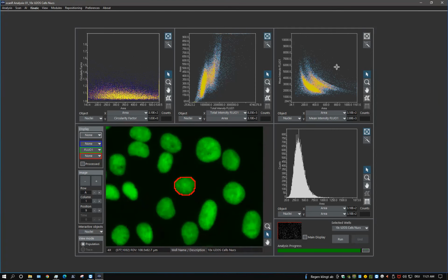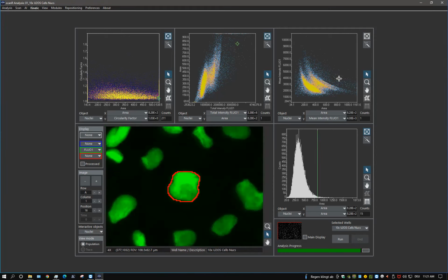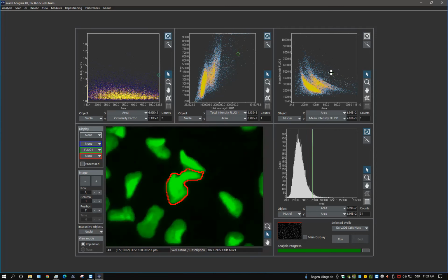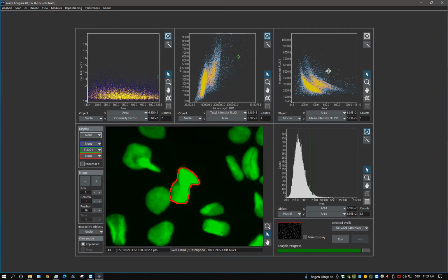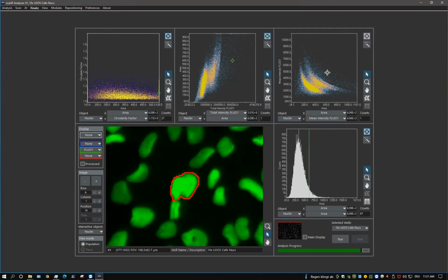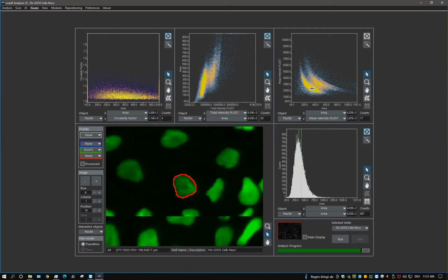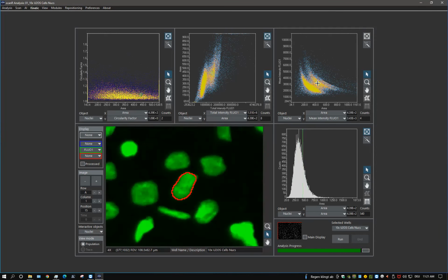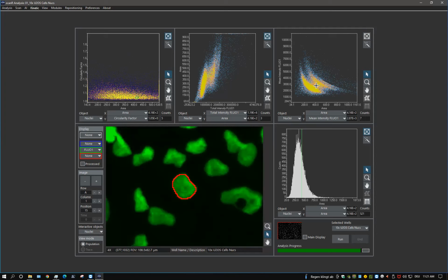And what I see here in contrast is that the fraction of bad detections, of wrong detections, is really low. So everything here with unusual size is either not a valid nucleus or some nucleus which has changed due to some treatment or something. But this is a really low fraction. So 99.9% of the detections are really valid nuclei and can be used to do the analysis of the biology inside. So this worked out of the box without any adjustments.